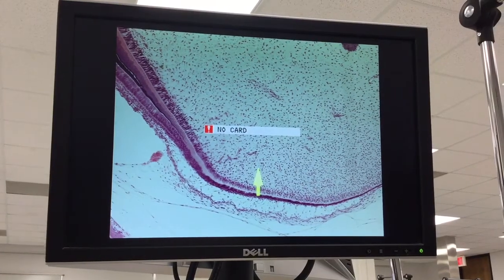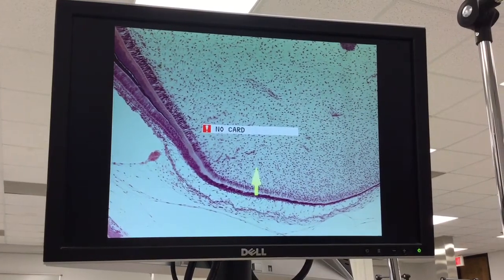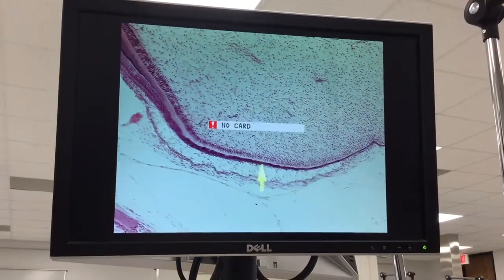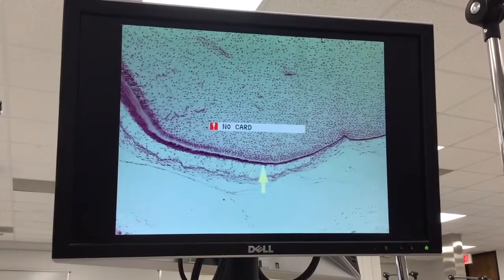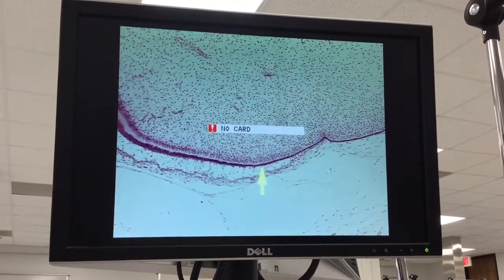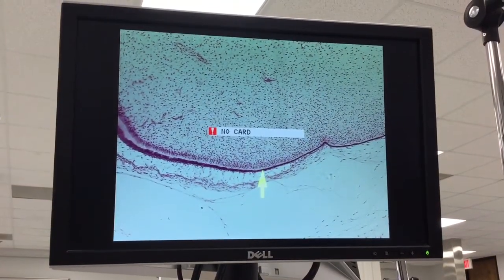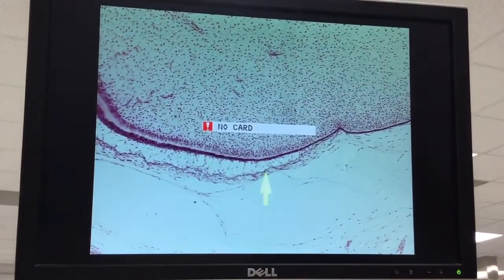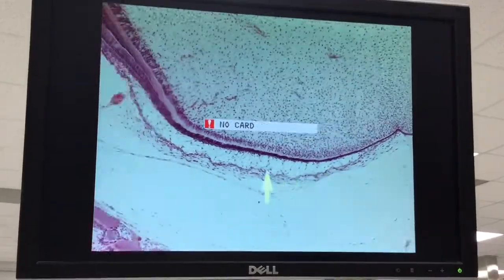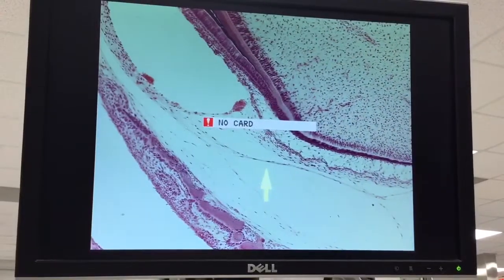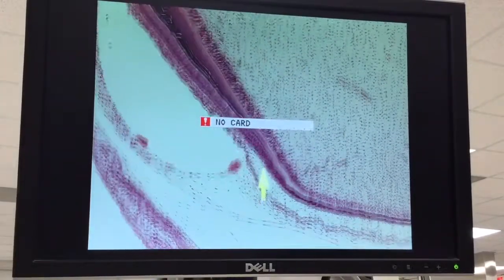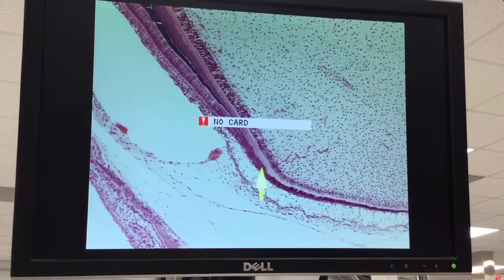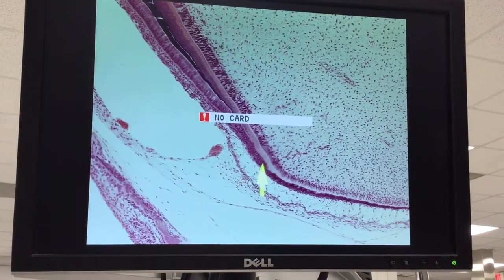Going back to amelogenesis. Here we have ameloblasts in the morphogenic stage. There's the outer enamel epithelium. As we come up, we've got some dentin forming in here, so we'll call that the organizing stage.